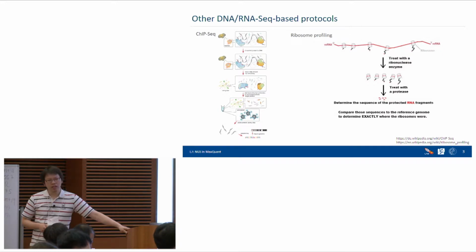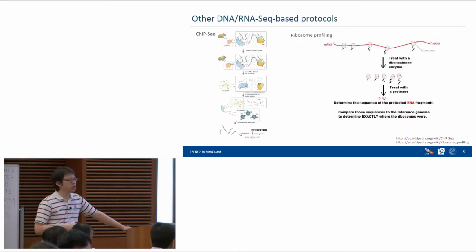can get the signal or the whole information from the RNA part. And then there are also many different protocols using DNA sequencing or RNA sequencing to achieve different purposes. So I just briefly introduce two of them. One is DNA-based, the other one is RNA-based.